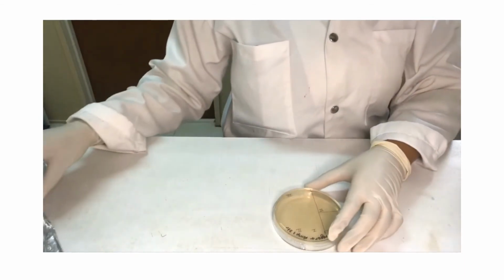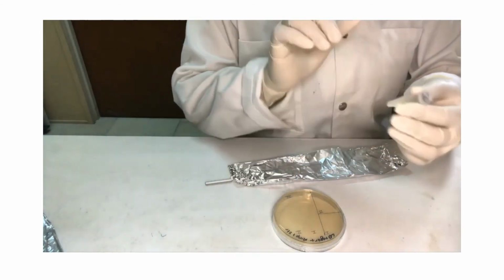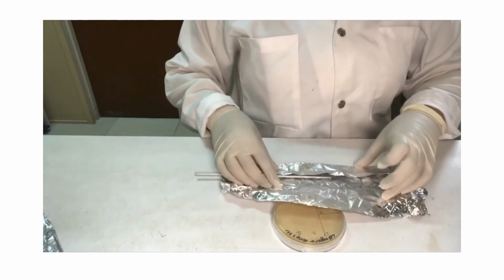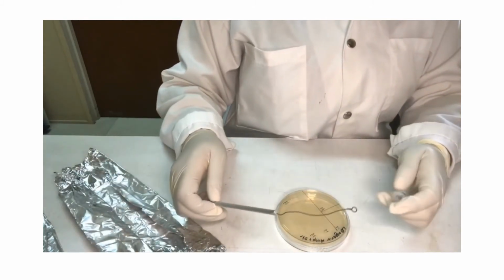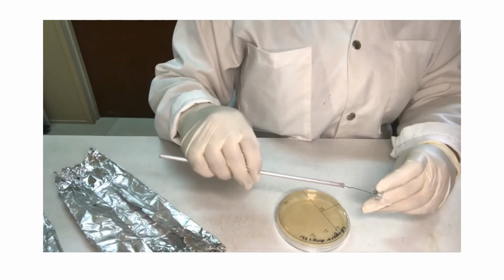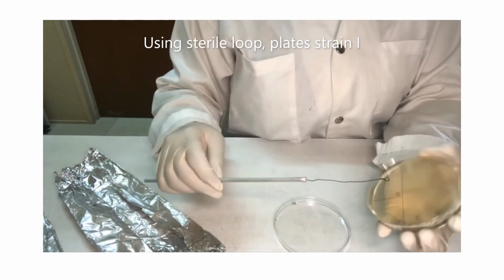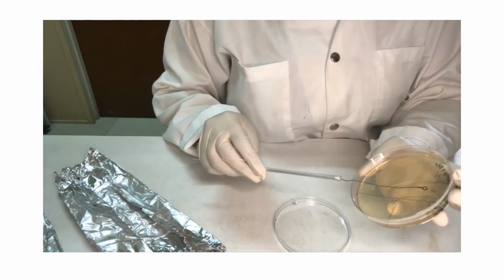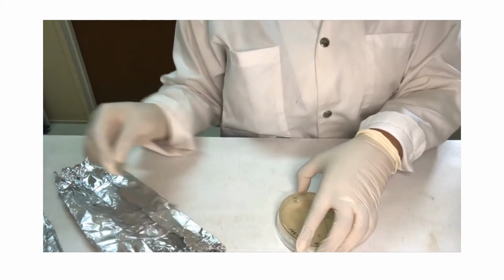The purpose of this plate is to bring the bacterial cells into close proximity with each other so that conjugation can occur. This tube contains strain 1 bacterial cells. A sterilized loop is used to collect a loopful of strain 1 bacteria. Region 1 is now inoculated with strain 1 bacterial cells, and some of these cells are also placed onto the area marked 1 in region 3.